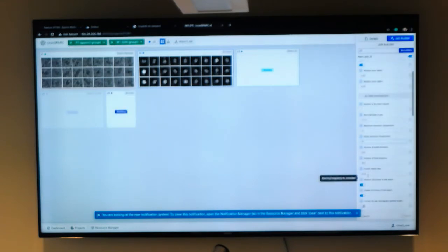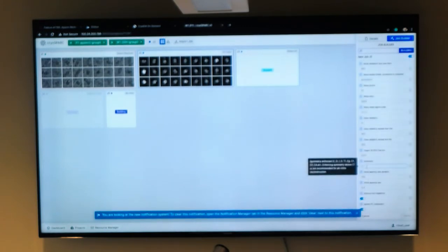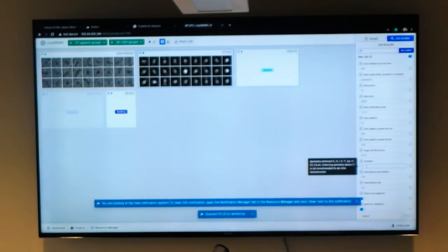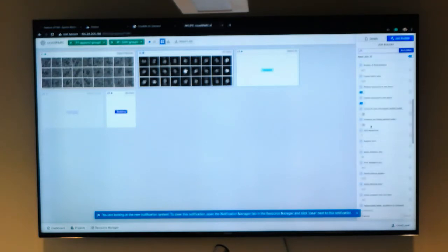Most of the time for ab initio reconstruction, people use C1 symmetry, but you can see what happens if you do add symmetry. D symmetries are a little bit tricky because you can have C1, C3, or D3. You can choose what type of symmetry you want to process in. And you may find one is better for your criteria for sorting out data.